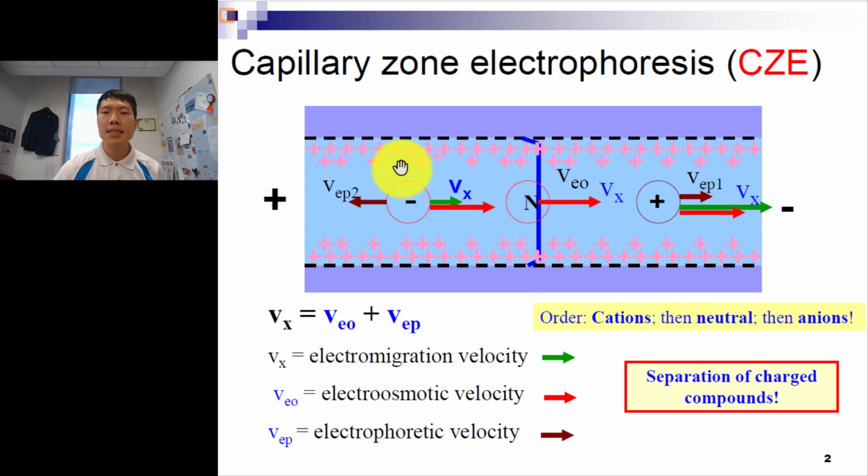Now we talk about CZE. This is the first CE method that was invented and reported. As you know, the capillary is a very fine, small tubing, and you have the different zones as peaks. Recall that electrophoresis can be seen as an analogy of swimming in an electrical current. In the normal configuration, you have a positive voltage here, and the positive ions will be pushed and travel the fastest because of the opposite Coulombic repulsion. The neutral ones are not affected by the voltage because they are not charged, and the negative ions are attracted backwards, that's why they are slowest.